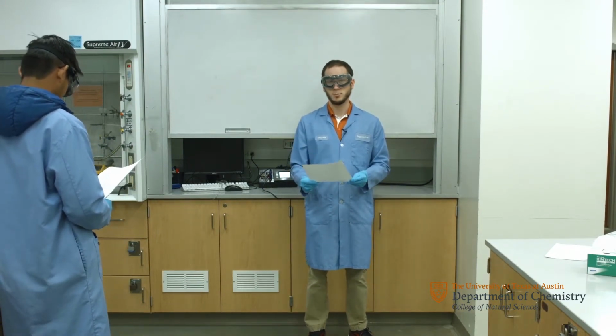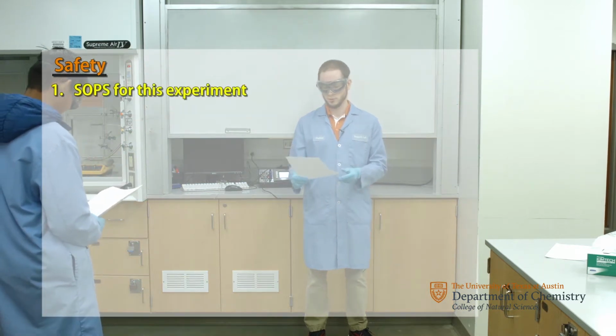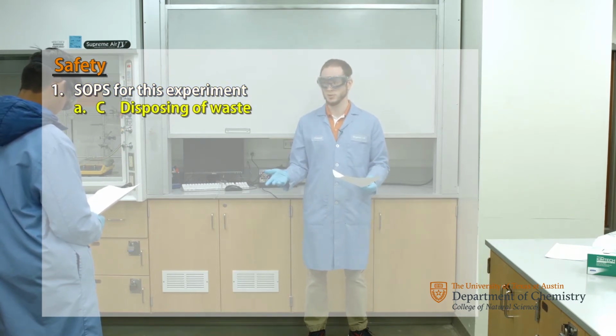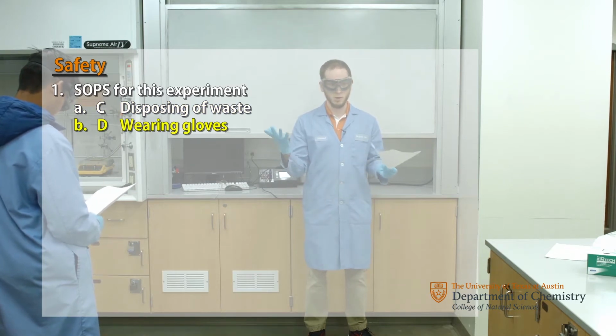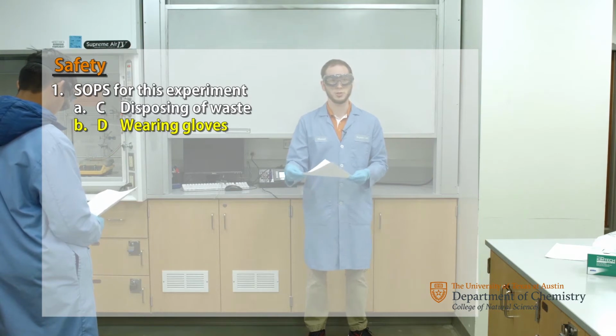So for every lab, safety is paramount, so you're going to want to make sure you follow standard operating procedure for this experiment. Disposing of waste, all of the waste that's going to be generated in this lab is non-halogenated organic waste, so be sure and dispose it in the proper bin over by the waste disposal. You're going to be wearing gloves for this experiment. If you ever get anything on your gloves, any solvents, any chemicals on the gloves, go ahead and take them off, throw them in the trash, get yourself a fresh new set.